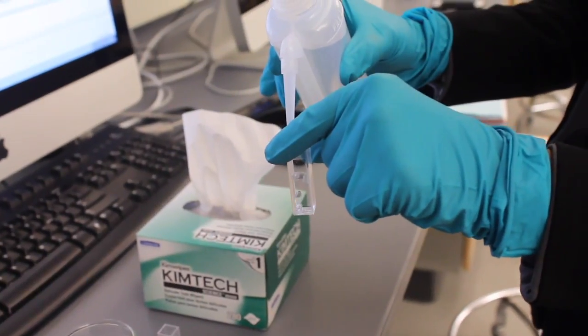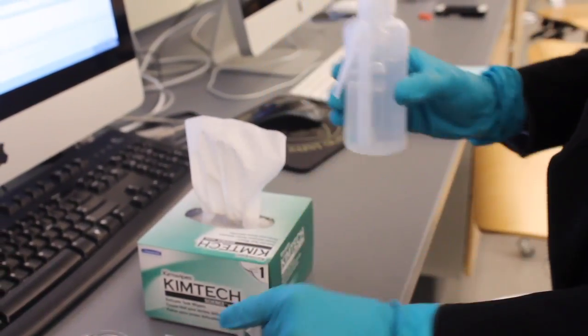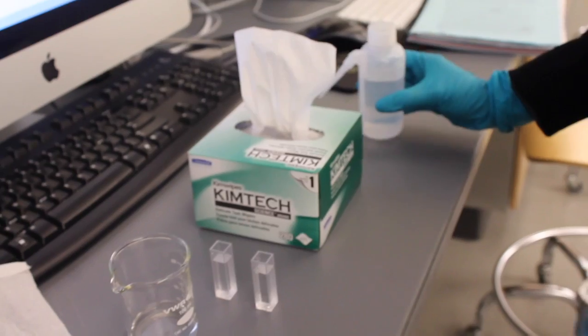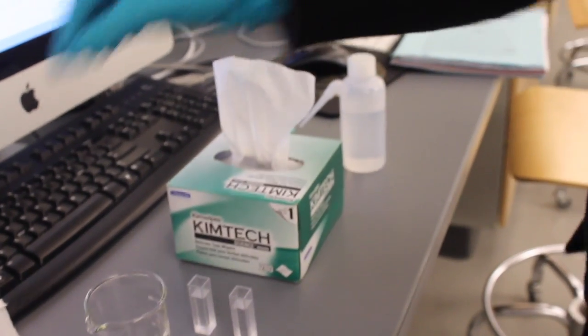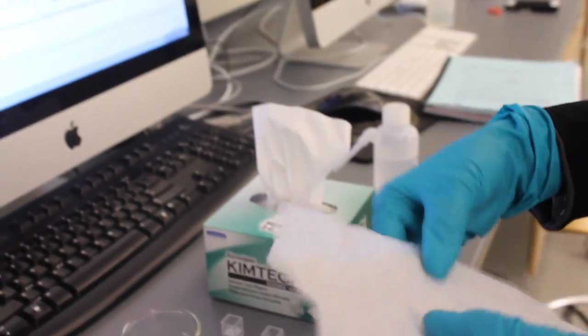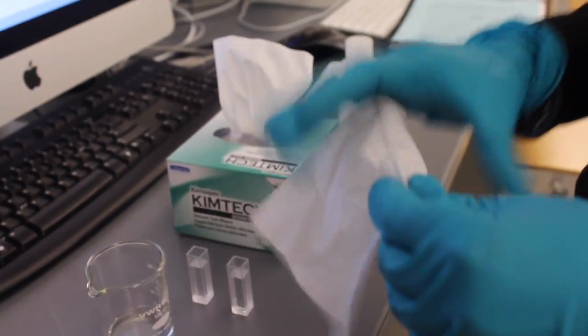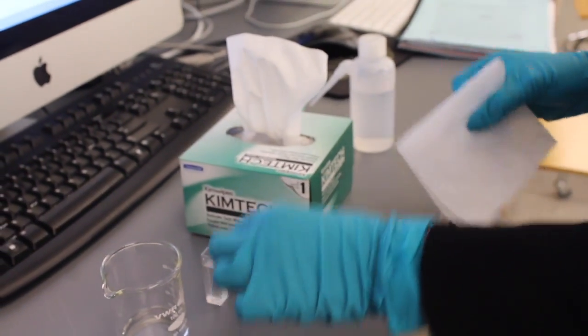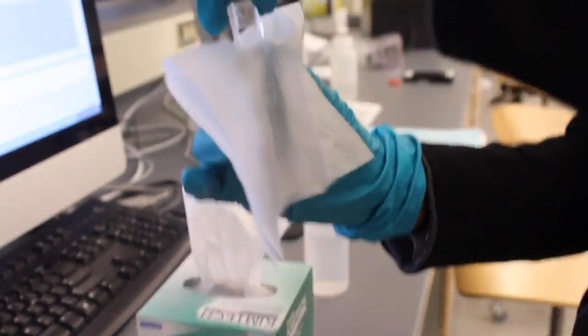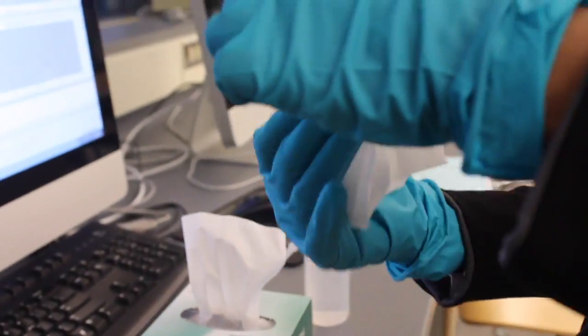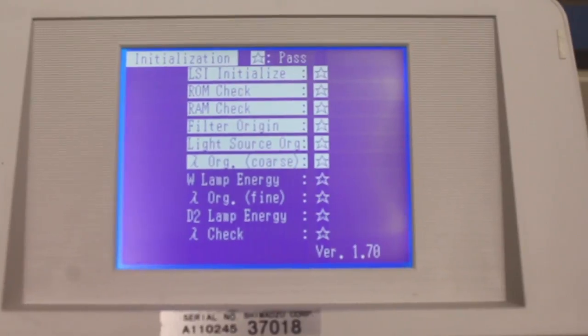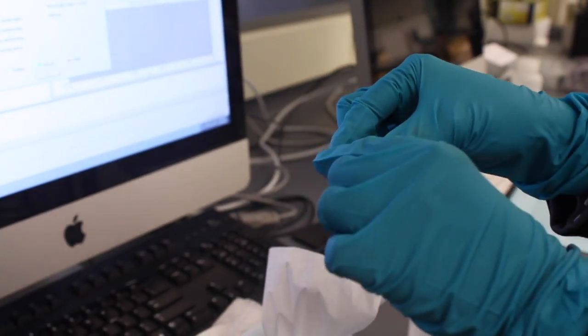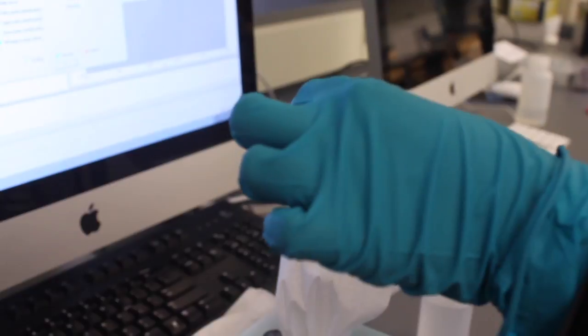Fill 2 cuvettes with DI water within a centimeter of the brim. Use the tissues to clean and dry the outside of the filled cuvettes to ensure a clear pathway for light to travel. You can begin to prepare your sample cuvette while the initialization is finishing up.